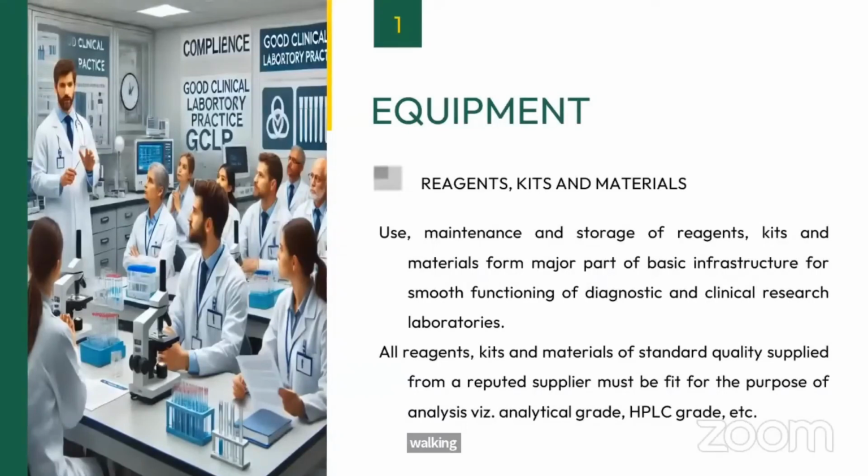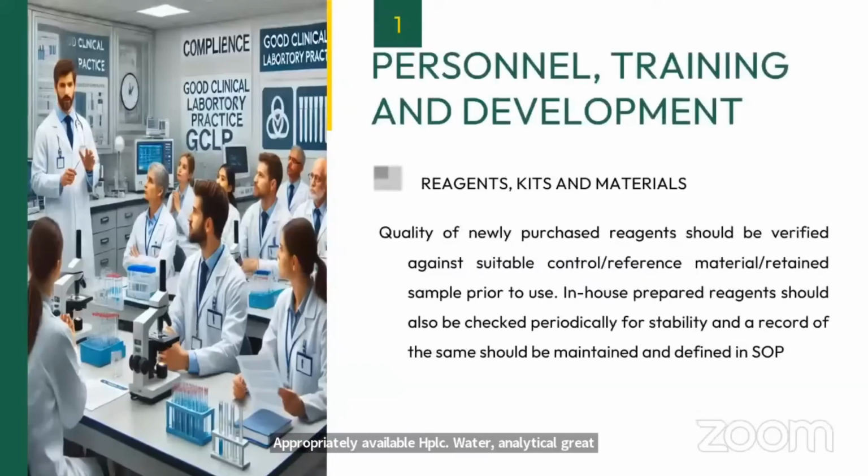All the reagents, kits, and materials of standard quality supplied from reputed suppliers must be fit for the purpose of use. So IVD certified materials, certified reagents, HPLC grade water, analytical grade water should all be appropriately available from authorized personnel and authorized suppliers.